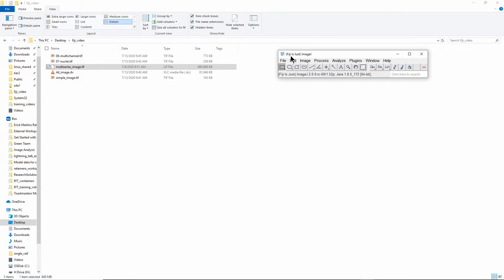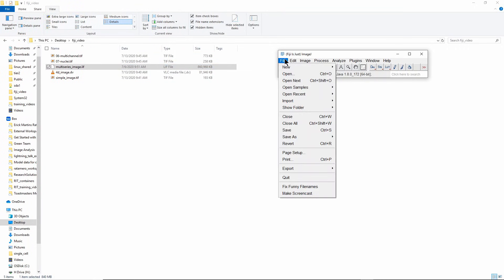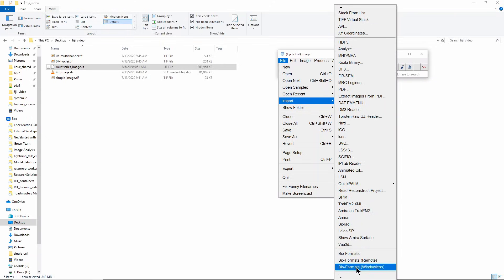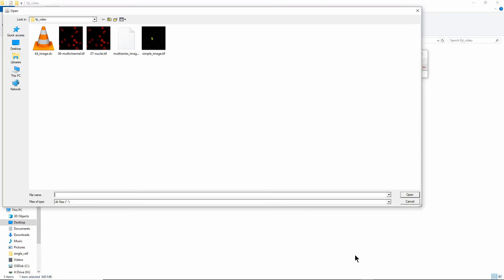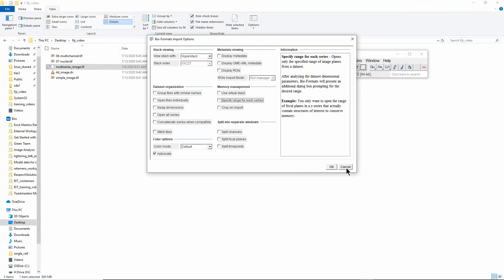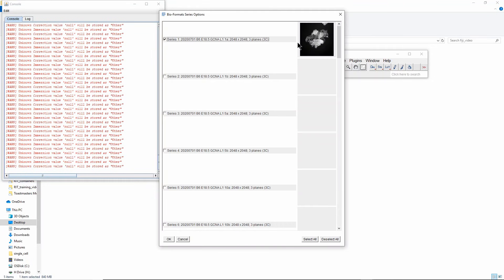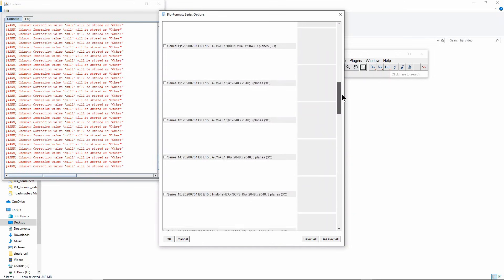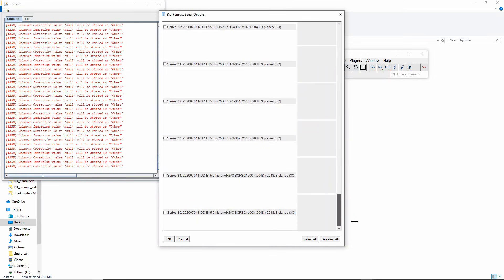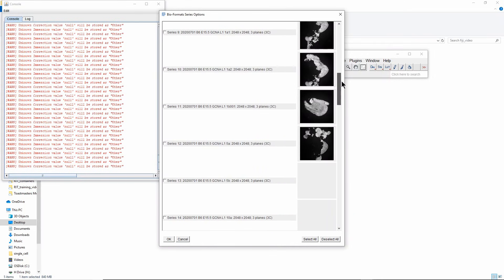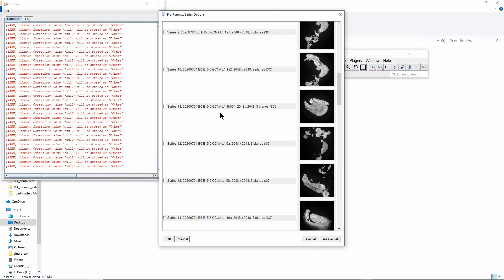If you go to File > Import and you have to scroll down a little bit to BioFormats, I will pick that same LIF image and you will see that what I get is this BioFormats series options window that gives me the choice of in this case 35 different series. So that file actually contains 35 different images, each one that is 2048 by 2048 with three planes.